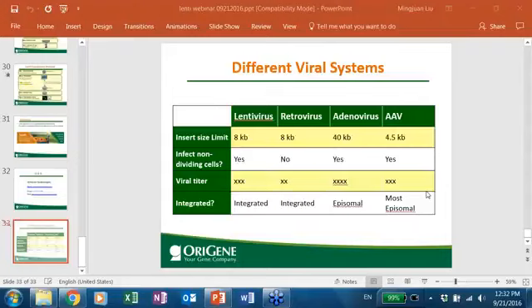Here you mentioned MOI. Maybe you have other questions too. For different cell lines, the optimal MOI, you need to find out using the control particles to see which MOI gives you a higher transduction efficiency, especially using the GFPs. You can directly see the gene expression level.